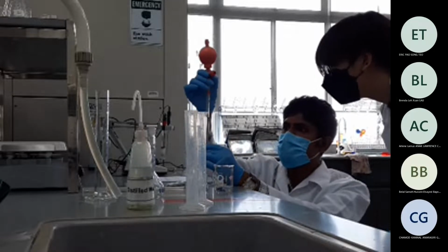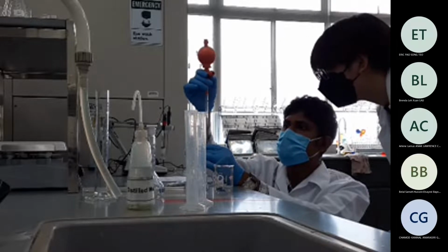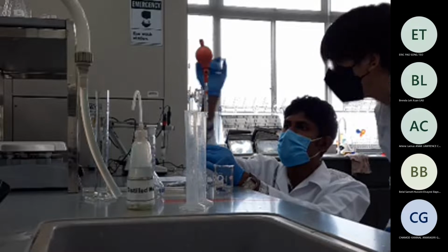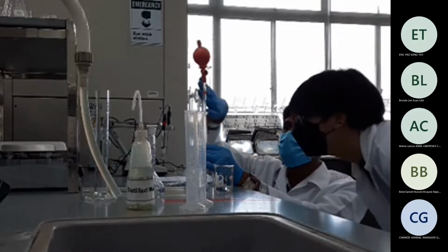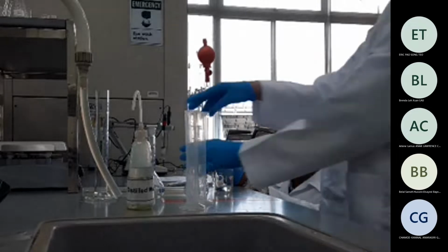It's a little bit more. Don't worry, you can always release it. Yeah, now you see that the meniscus is touching. So this is the 10 milliliter. Okay, take it now.